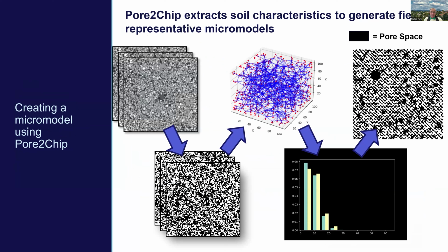Okay. So if you look at the 2D cross sections on the left, they look very different than the reconstructed medium that you have there. As I understand, the reason is that you have those three targets that you use, the pore size, throat size, and coordination numbers. These are the three things that you probably optimize to create that 2D image out of the 3D image.